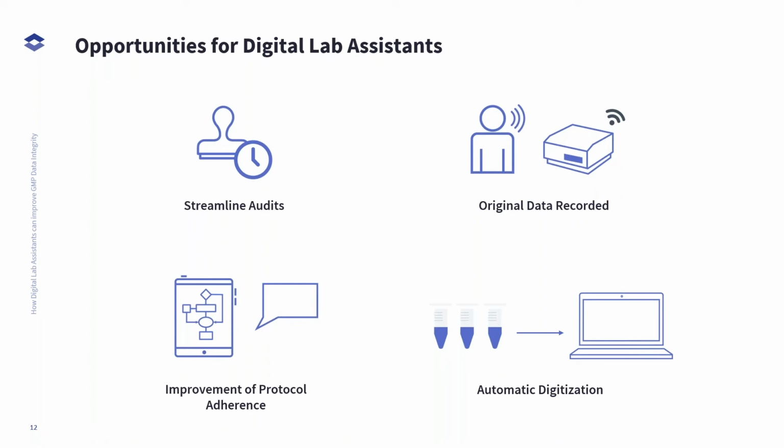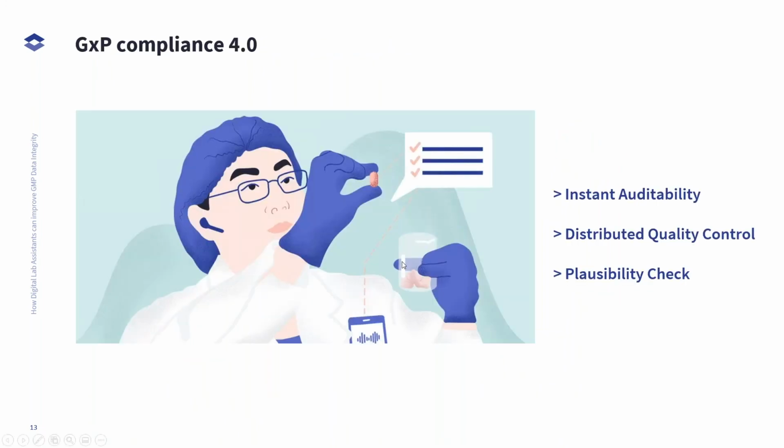Thanks. And thank you, Cheryl, for that input. Very interesting how you see that future. Let's look even more into the future. Obviously, from what we've heard here, GMP labs are still trying to cope with heavy documentation and paperwork. There appears to be a future of automatic data capture, as we've discussed here, and direct digitization of that data. Obviously, that could accelerate the process and make it more secure.